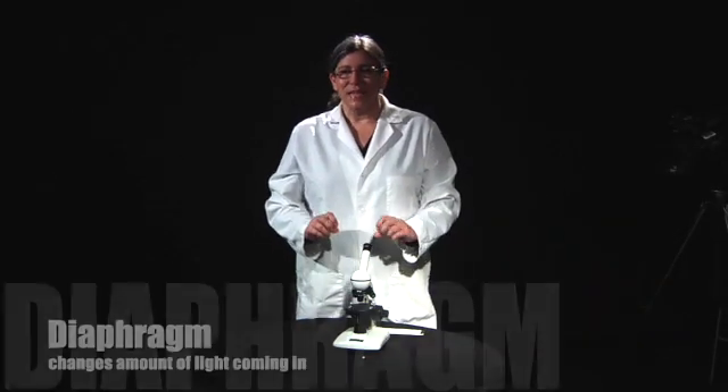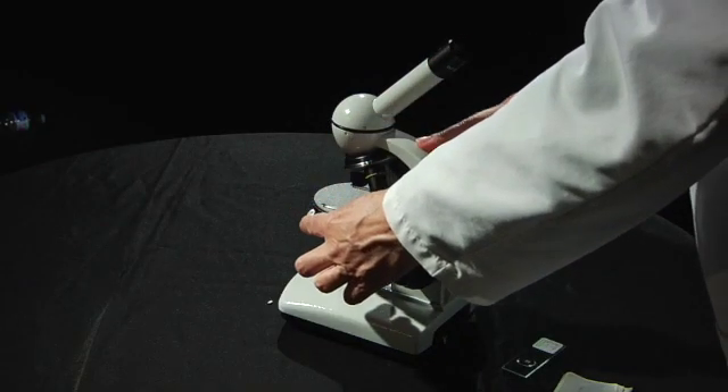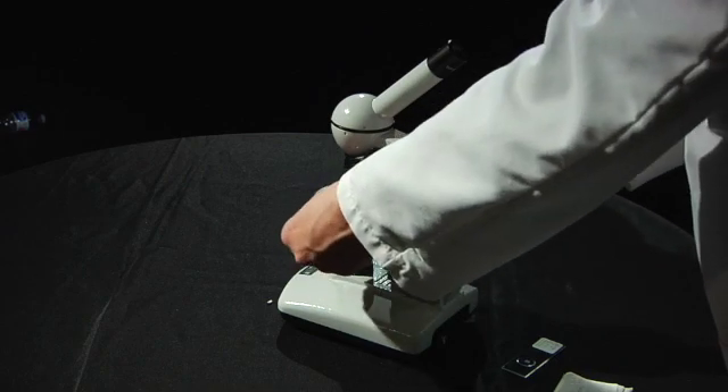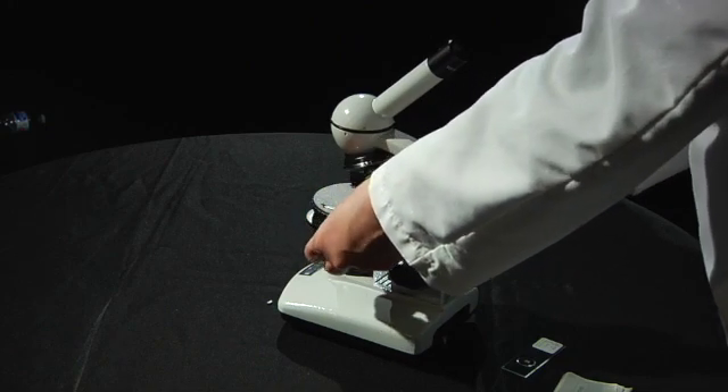Next we have the diaphragm, and the diaphragm changes the amount of light that goes in and out of the microscope. I'll show you how to adjust that later, but for now the diaphragm is called a disc diaphragm, and if you turn this disc — it's just below the stage — different numbers will show up and different amounts of light will come through.